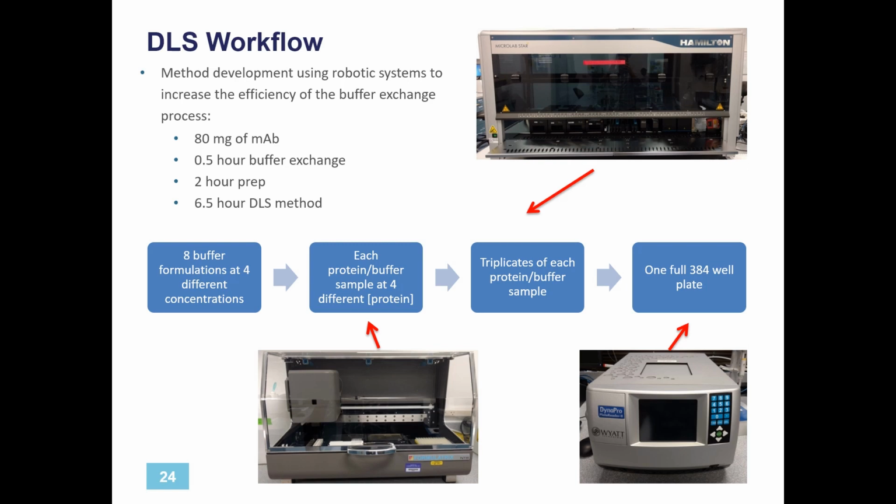Now, most of our clients are ready to develop these proteins into therapeutics, so protein quantity is not much of an issue, although we do try to be careful with the proteins. It takes us about 2.5 hours to prep the plates, including the buffer exchange using our robots. And then the way we have our DLS set up, it takes about 6 hours for the DLS plate to be read. And that usually happens overnight. So when we come in the morning, we have all of our data ready to evaluate.